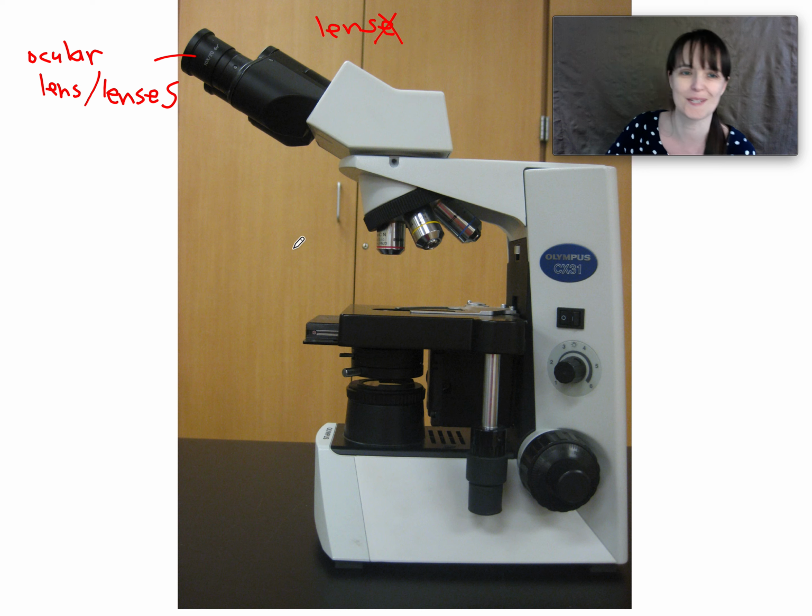I think I've caught all the misspellings, but anyway, so either one ocular lens, or two ocular lenses. And generally in English, to make something plural, you'll either add the S or the ES. If it adds a syllable, then it's an ES.